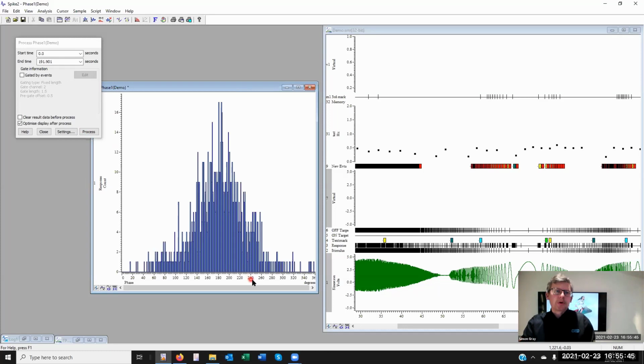Okay, so what this has done is set the start and end markers on the stimulus channel, say the peak here and the peak here, as being beginning and end. And that's divided up by 360. So that's your total duration of the output.